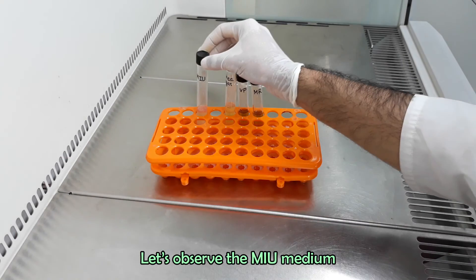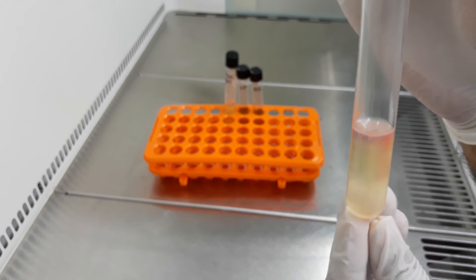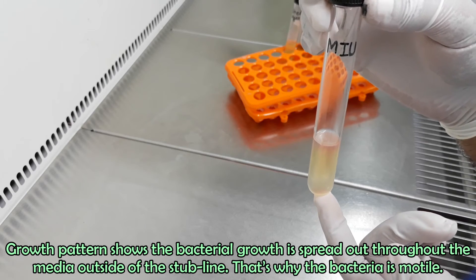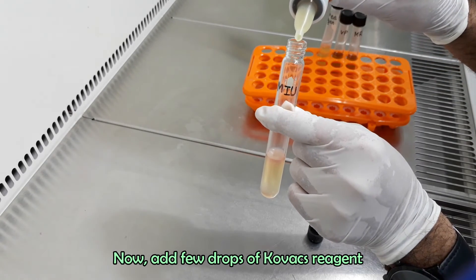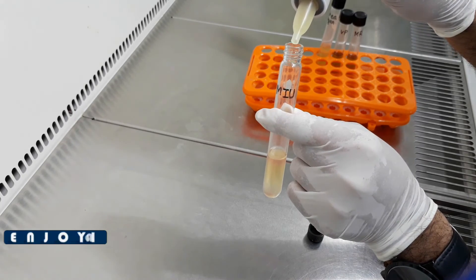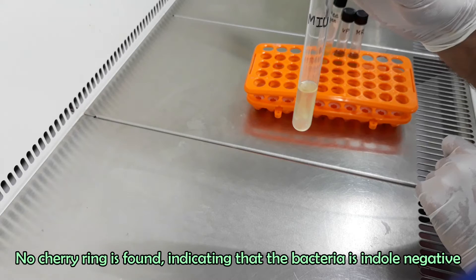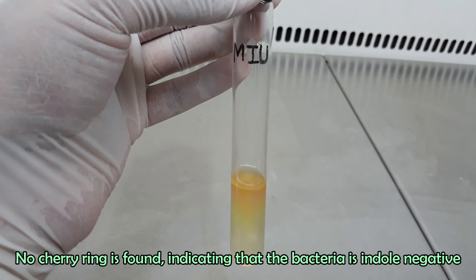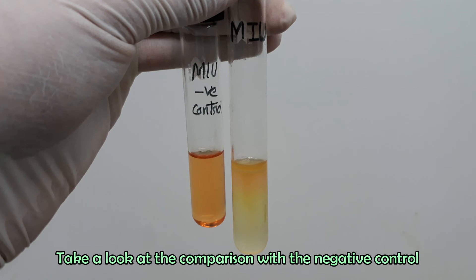Now let's observe the MIU medium. The media color did not turn pink, so the bacteria is urease negative. The growth pattern shows bacterial growth spreading throughout the medium outside of the stab line, indicating the bacteria is motile. Adding a few drops of Kovacs reagent — no red cherry ring is formed, so we can say the bacteria is indole negative.